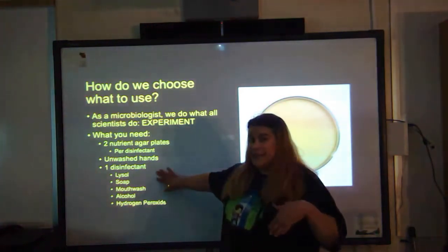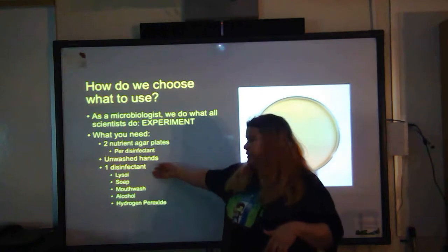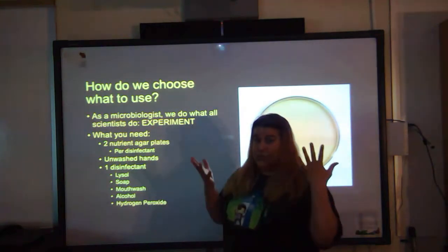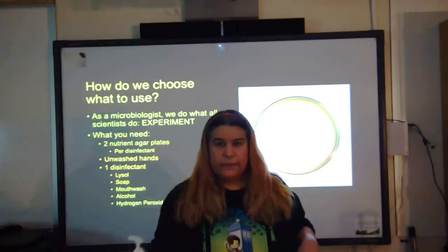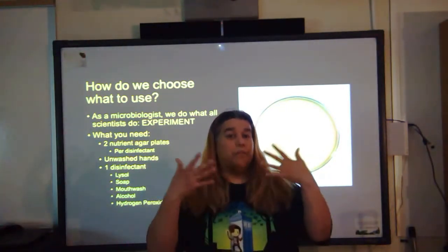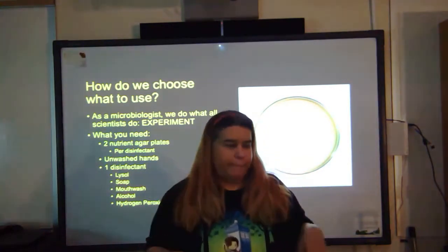The disinfectants, it can be anything. It can be hand soap, it can be Lysol. Mouthwash also has antiseptic in it, so you can use that. Alcohol, hydrogen peroxide, hand sanitizer. Any of these options are good options to see what happens. How much is left after you use them?